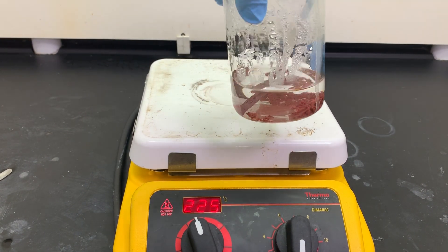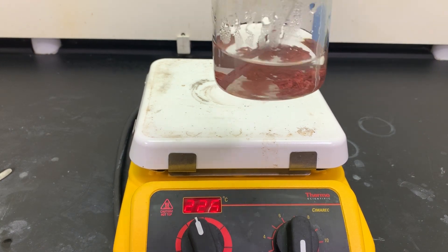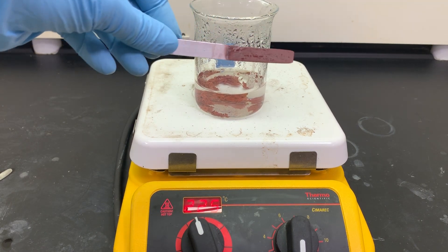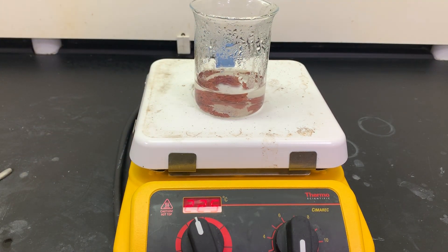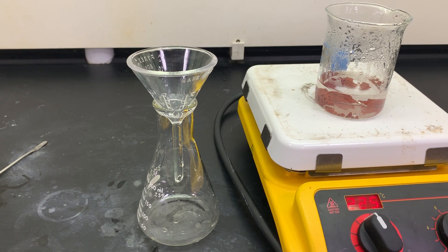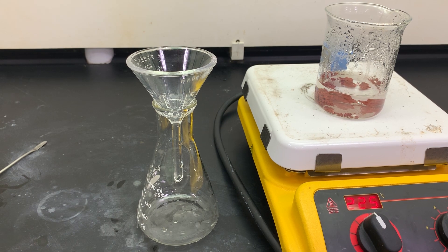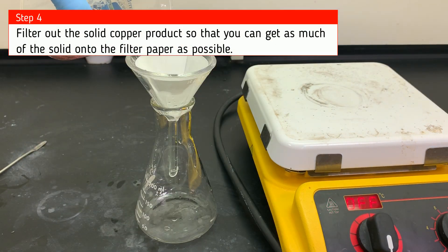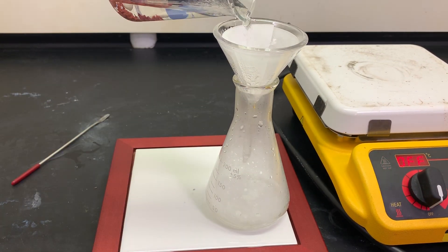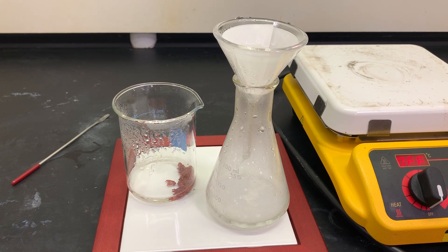Now would be an excellent time to record observations of your products. Into a glass funnel and on top of an Erlenmeyer flask, we are going to separate out the copper from the solution.